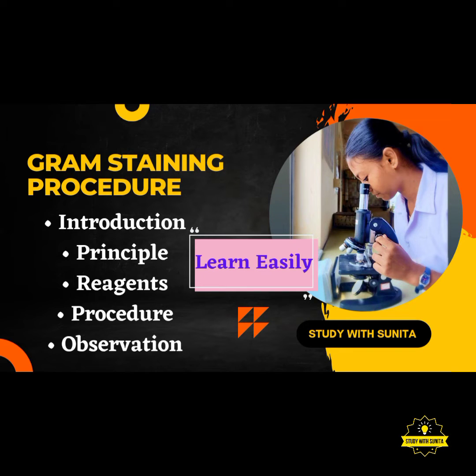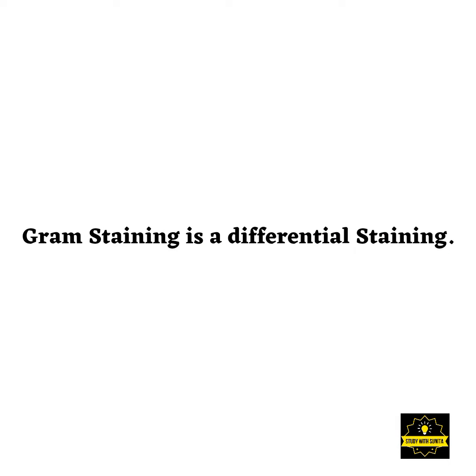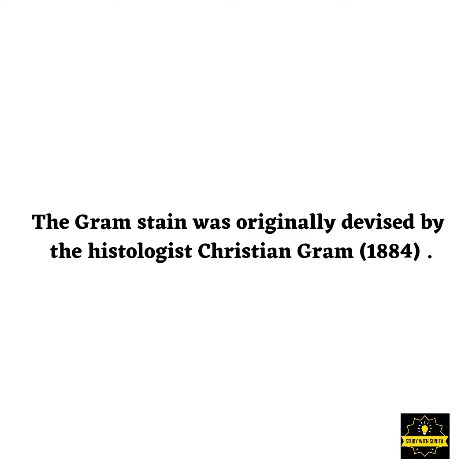In this video we will discuss gram staining. Gram staining is a differential staining. Gram stain was originally devised by Christian Gram.